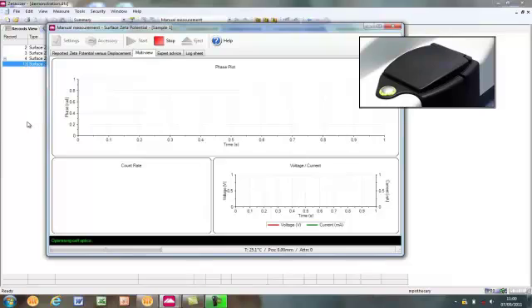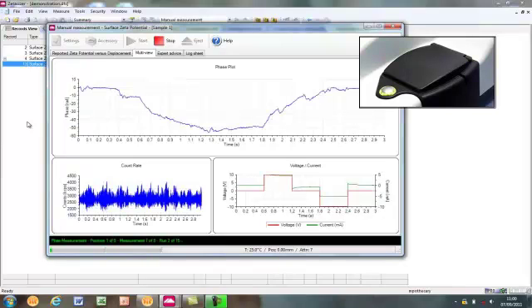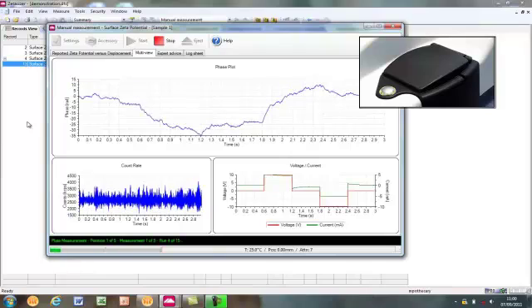In the multi-view window, it is possible to see the data as it is collected. First, the optics of the instrument are optimised for the measurement. This includes finding the best attenuator setting. The measurement then begins. The count rate, in this case shown in the bottom left, shows the raw count rate collected by the system. In this case, in the top window, shows the resulting phase data for the slow field measurement that is being made during the majority of the measurements performed.